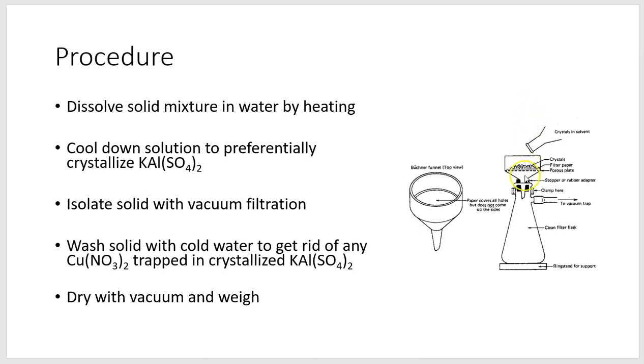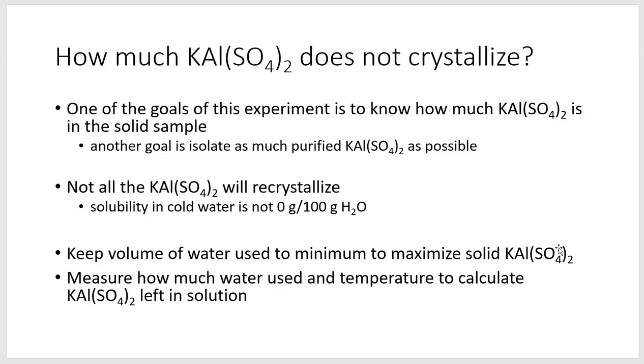Well, if we have a vacuum system here and we just leave it on, air will be continuously pulled over the sample, and it will be carrying away water vapor as that takes place. So we leave it to sit on there for about 15 minutes, and that'll dry out the solid. When we weigh it at the end, we just weigh the solid. We don't weigh some water that's attached to the solid.